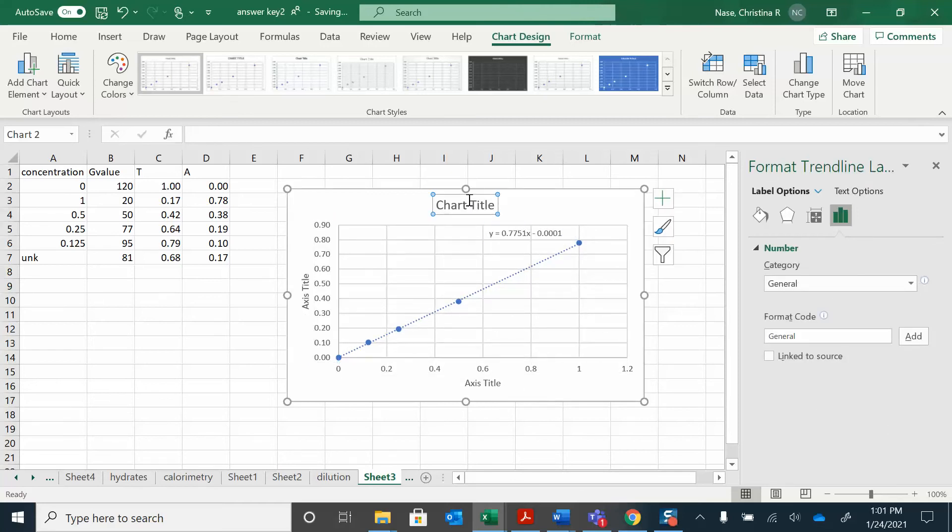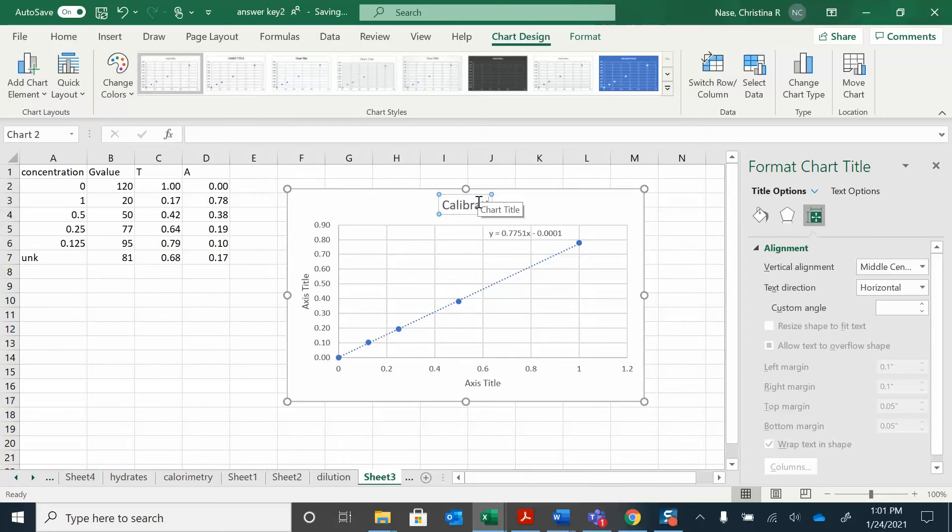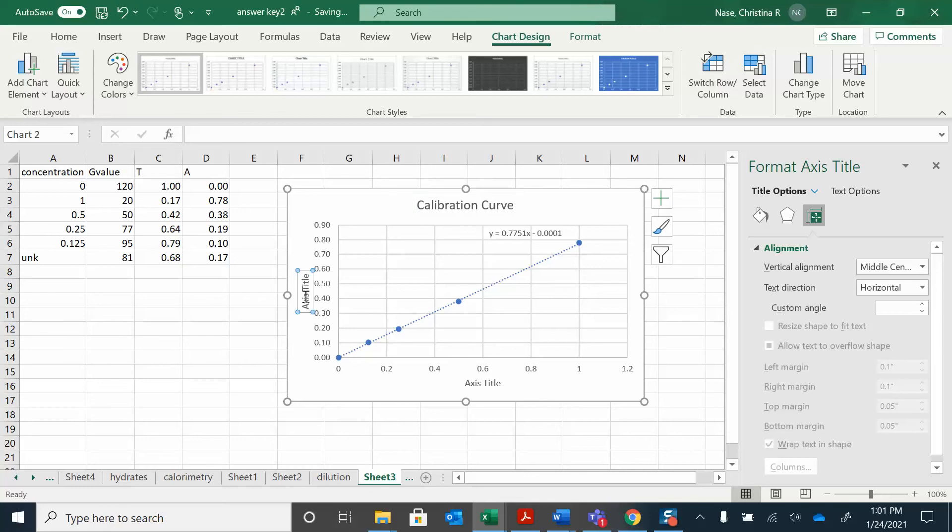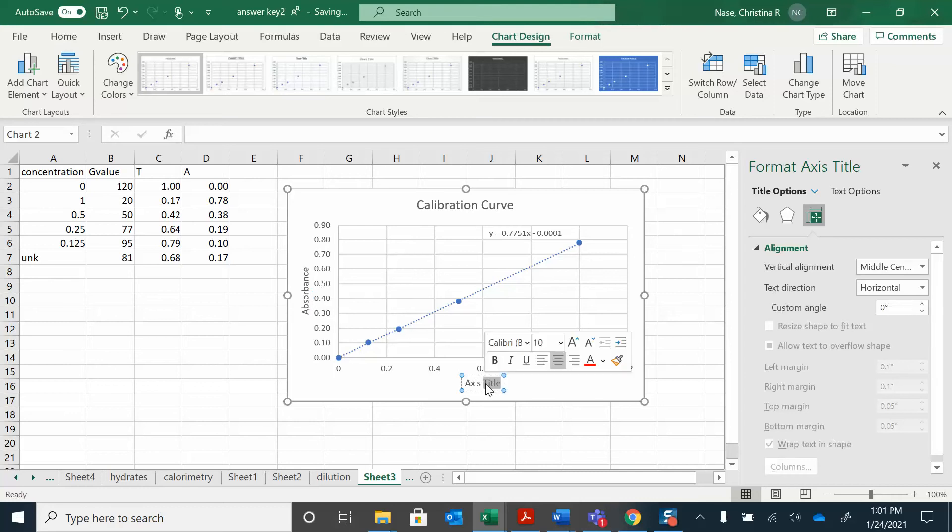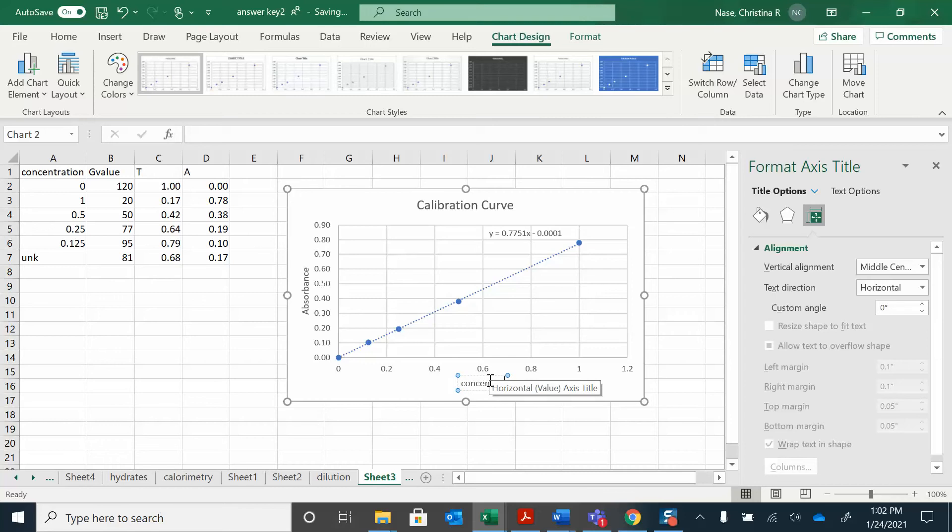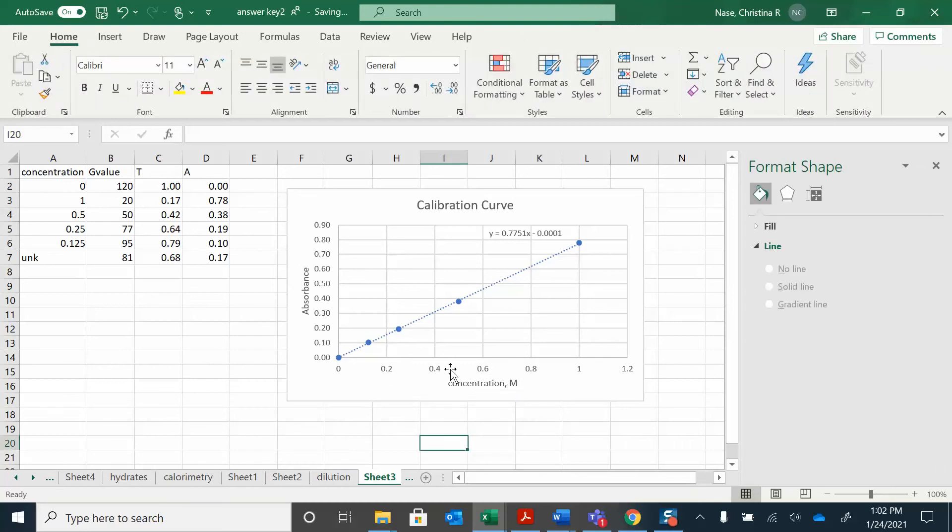I'm going to call this thing a calibration curve, and I've got my axis titles. I'm just double-clicking on those. This is absorbance, and the bottom I have my concentration. And this is in molar concentration.